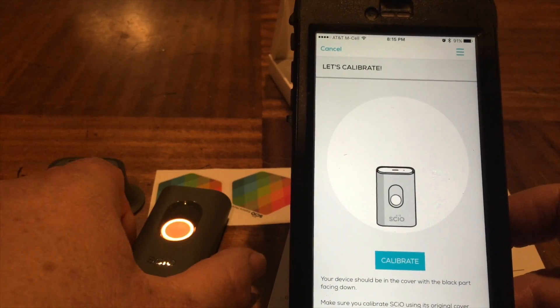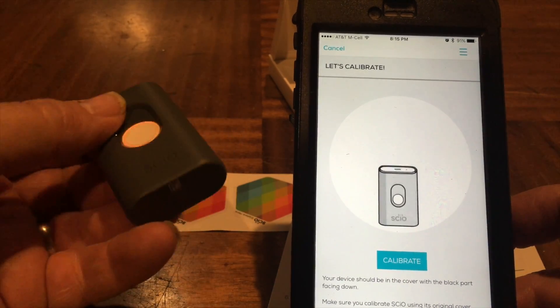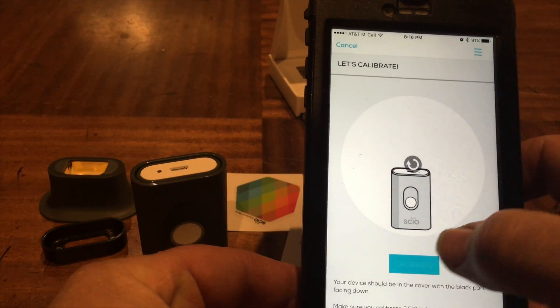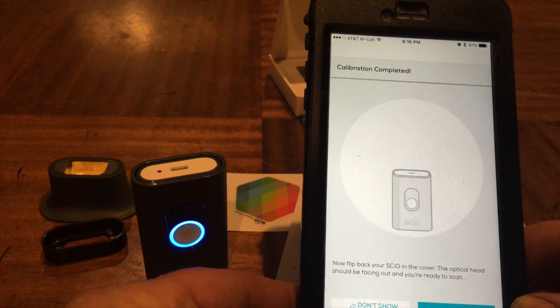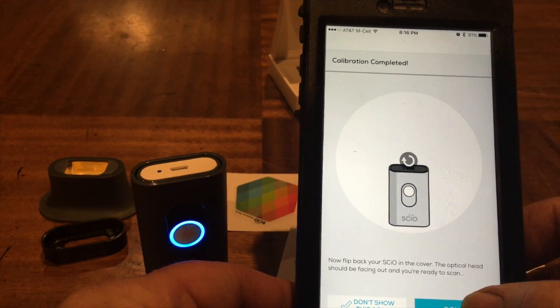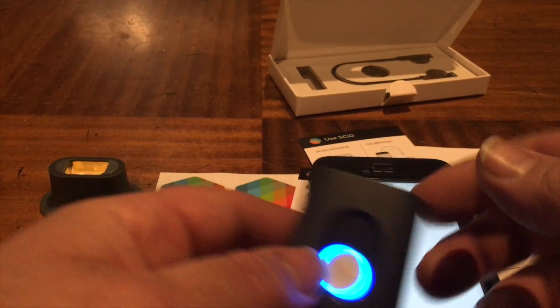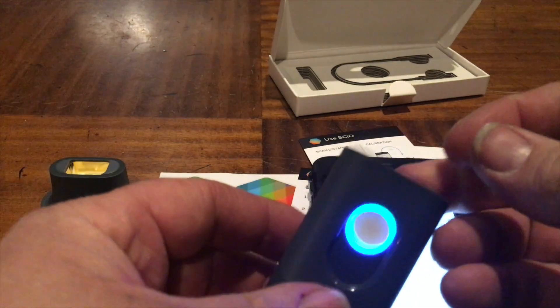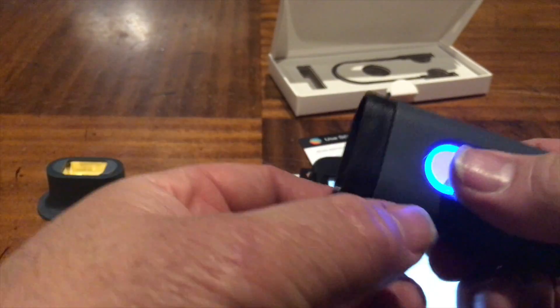Let's calibrate. It should be in the cover with the black part facing down - make sure it's in its original cover. Calibrate. Okay, so it turns a nice little white there. Now flip it over - it should be facing out and you're ready to scan. So flip it over like that, little shield there.